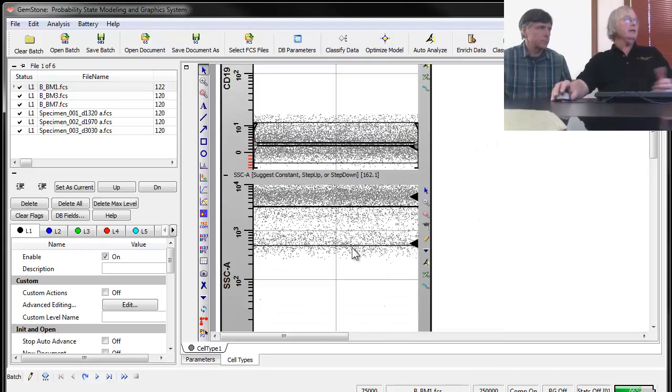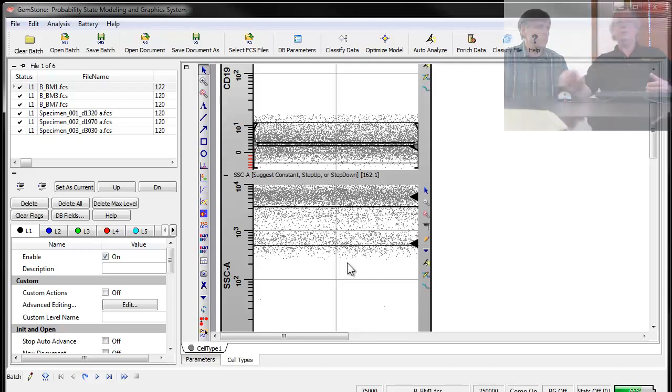And now we go down to light scatter. Light scatter is interesting because there's usually a lot of overlap with light scatter. So we usually have to tell our peak finding system to look for peaks using the steepest side of the peaks. This comes all the way from DNA analysis, where if you want to find the G0, G1 standard deviation, you look at the steepest side of the peak.